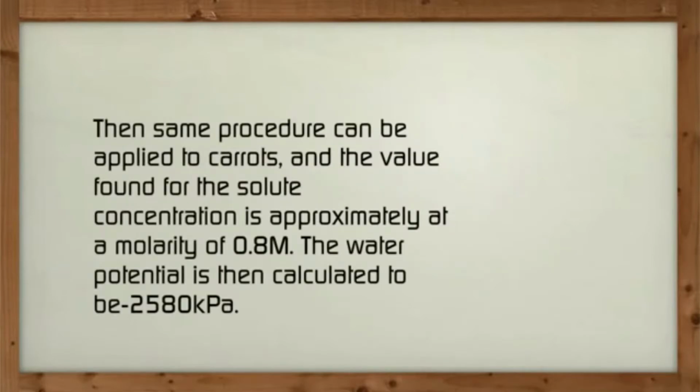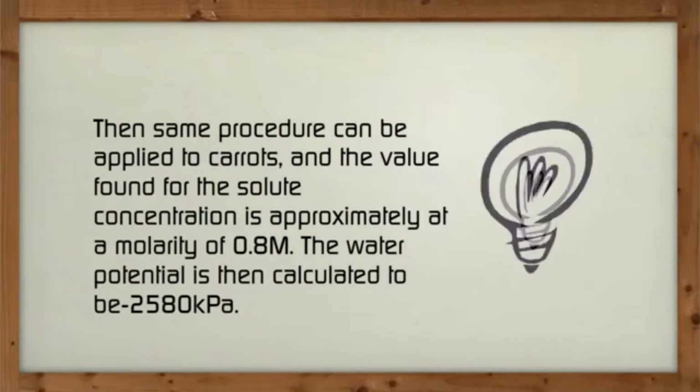The same procedure can be applied to carrots as well, and the value found for the solute concentration is approximately at a molarity of 0.8. The water potential is then calculated to be negative 2580 kilopascal.